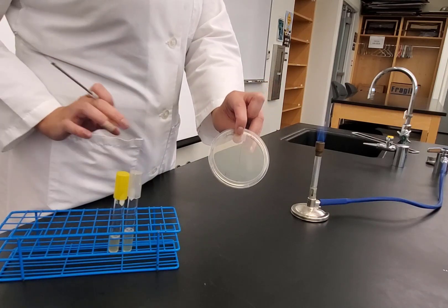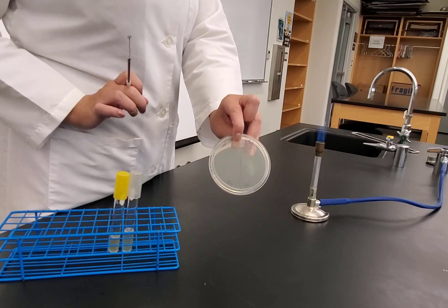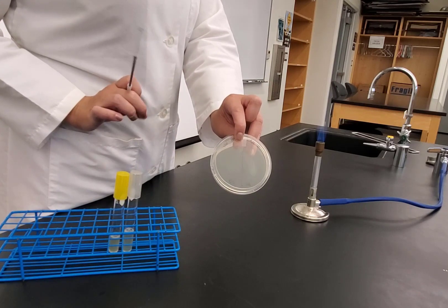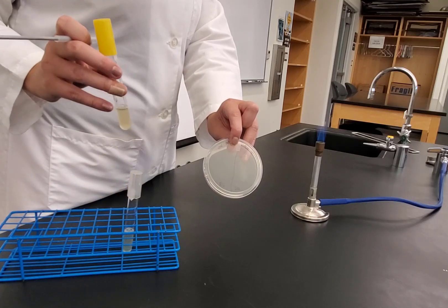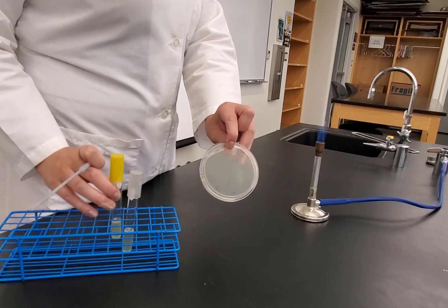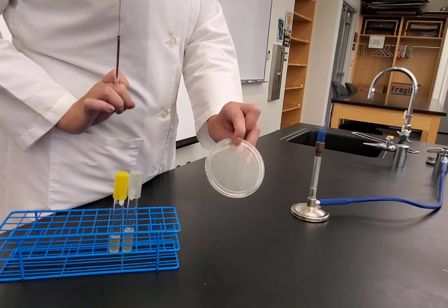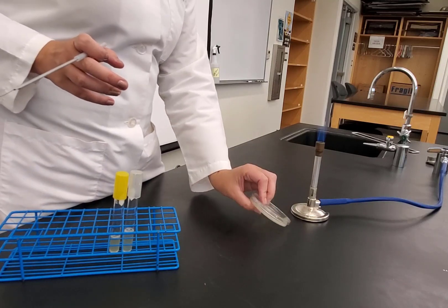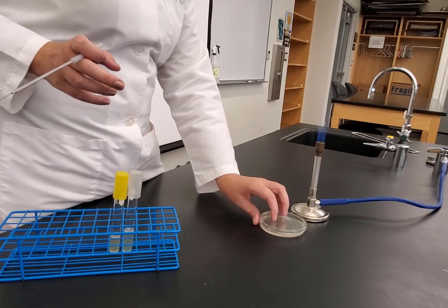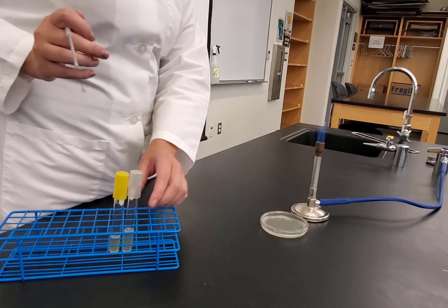I'm starting with liquid cultures and will use them to transfer onto this plate. I need to be careful because liquid cultures are more likely to spill. Especially the yellow cap one — that's Staph aureus, which is a pathogen, so we have to be extra careful. I'm going to take my plate, put it by my flame, and flip it agar side down so I'm streaking on my plate.